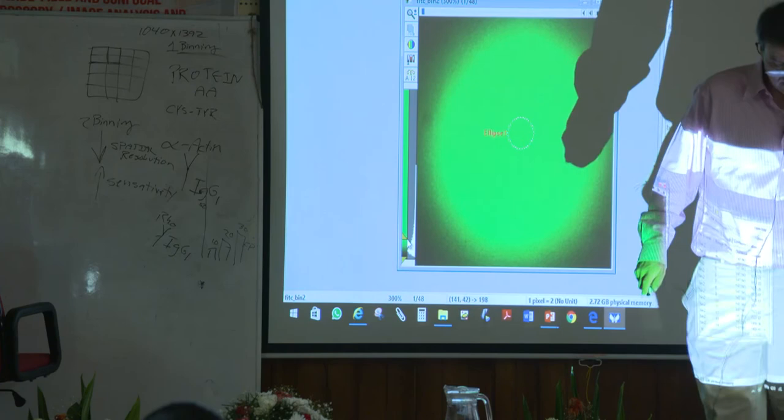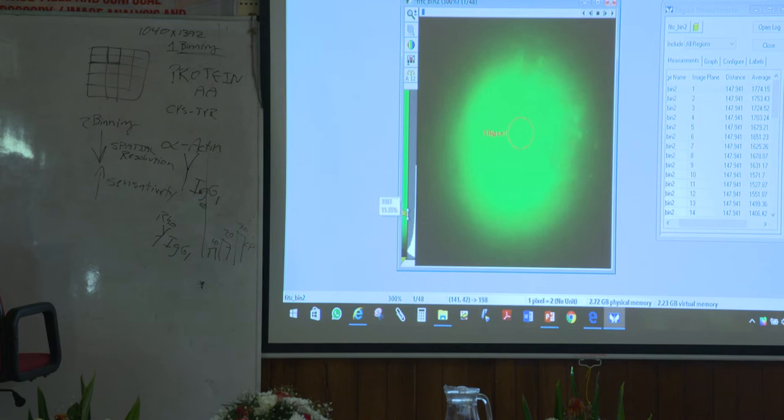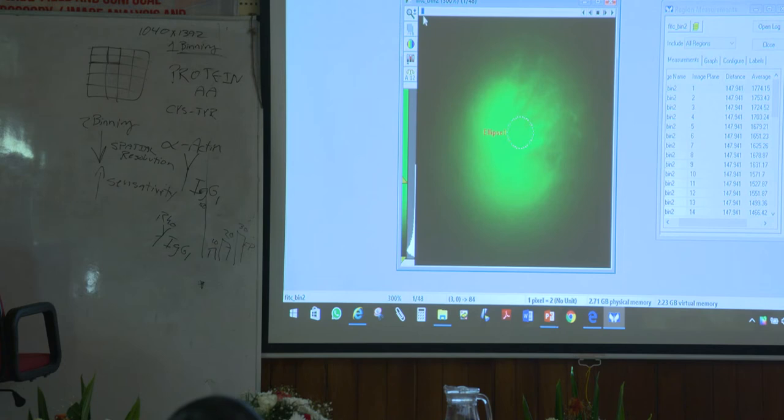Well, that's what this is here. I'm playing with the scaling. So I'm playing with that axis to make it look weird. Okay? The data is the data though, right? So even though it might look brighter, this is the truth here. Because what I'm doing right now, I'm looking inside this circle and I'm going through each plane. There's 48 planes here, and I'm actually getting the intensity value from this circle in each one of my deck of cards. Does that make sense? Okay, because remember, the way it looks means nothing. It's all about the pixel values that is the important thing. Okay?